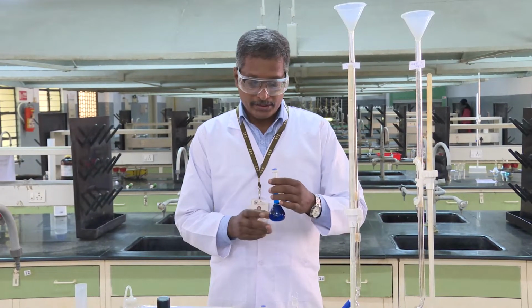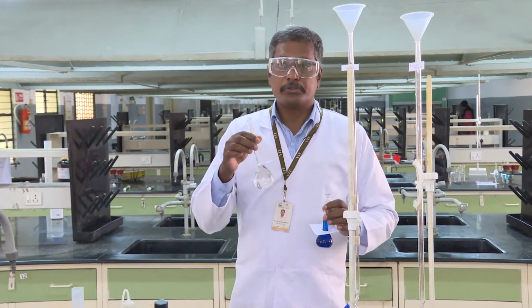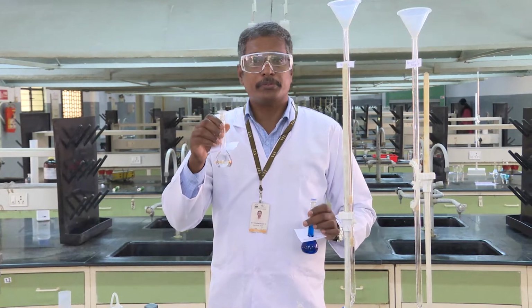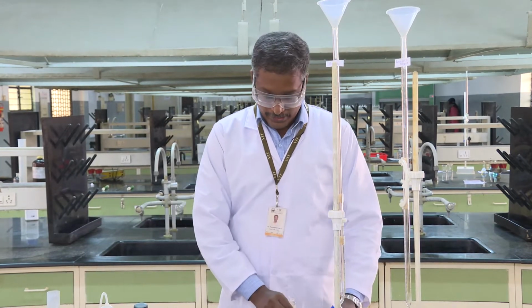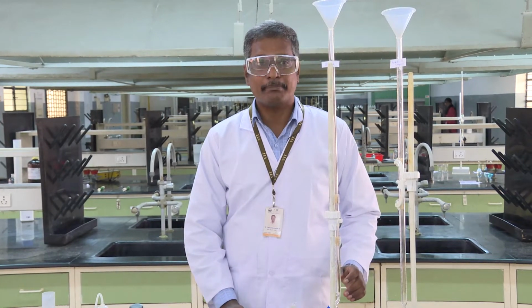So for that we need a stock solution of Benedict, sugar solution as the reducing agent, and then sodium hydroxide, because we need to measure 0.5 ml of Benedict solution and then 4.5 ml of glucose, and then the sodium hydroxide volume varies. Okay, let's do sample 1 first.